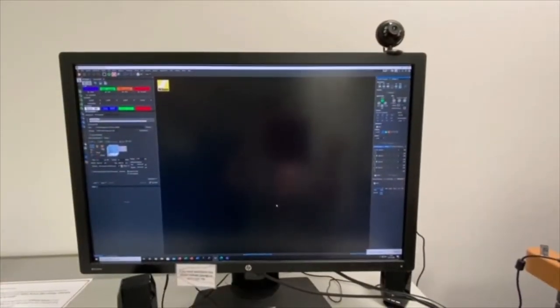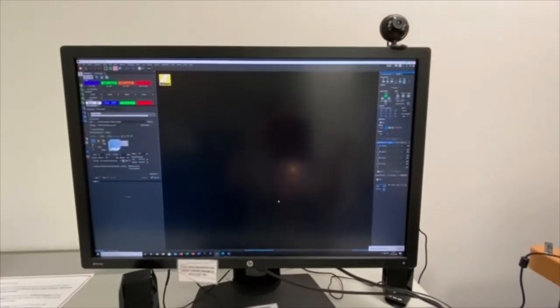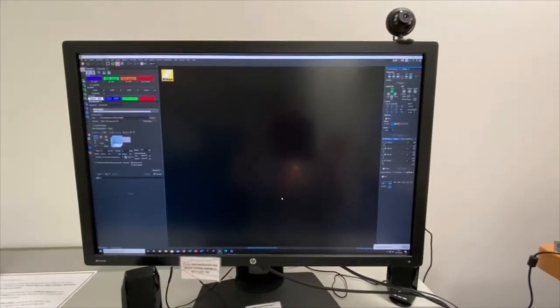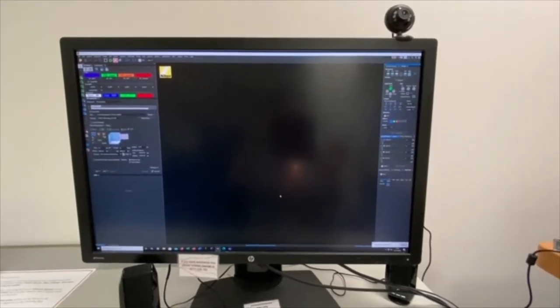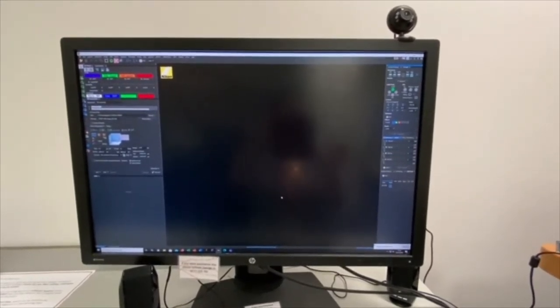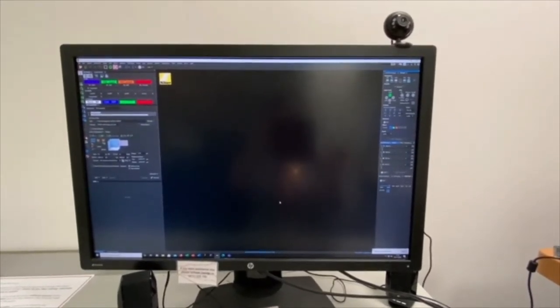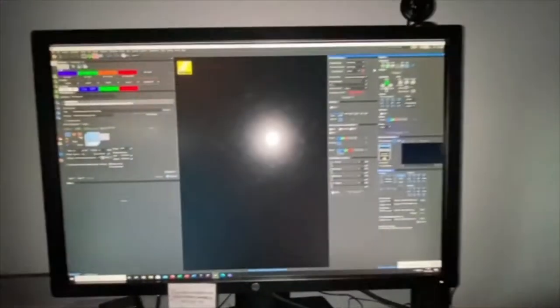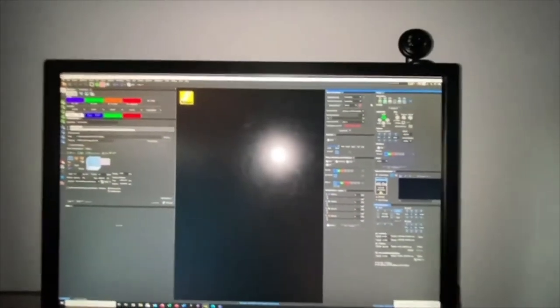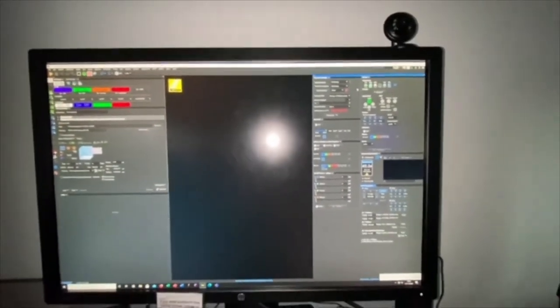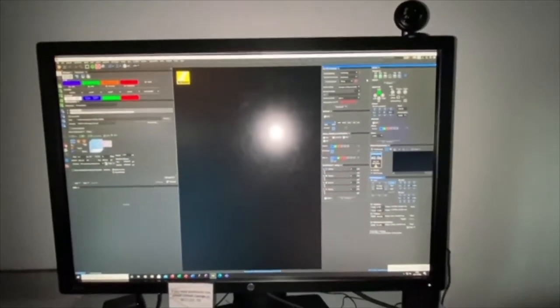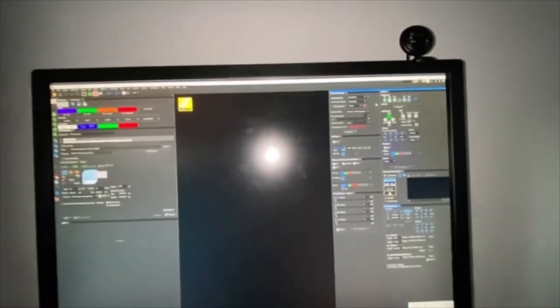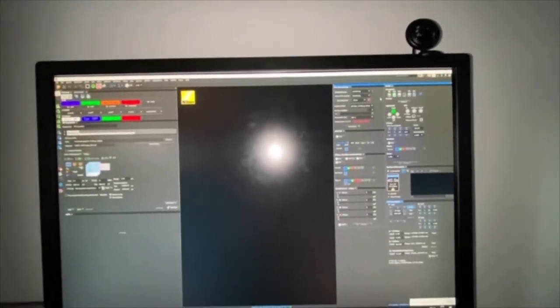Please wait until the software is fully loaded up and there are no error messages before you move on to the next step. Before we start using the microscope, you need to check that the lens you want to use is clean and undamaged.